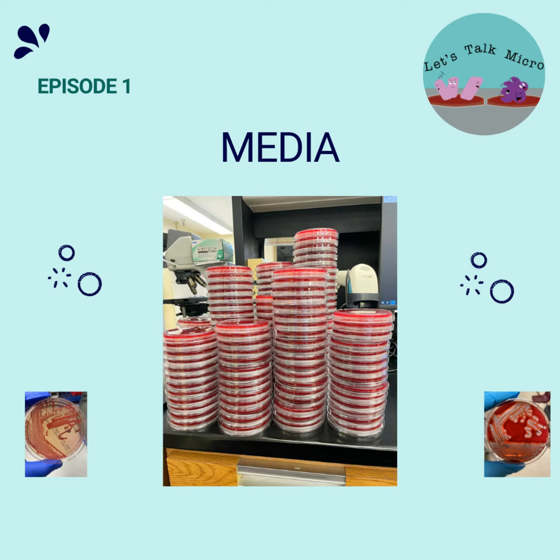And they need moisture. So, they need water for certain metabolic pathways. And even though the media actually has a lot of water in it, when we put it in the CO2 incubators, they start drying. So in order to keep that moisture, you add water to the incubators. So if you're ever wondering why do I have to put water in the incubator? It's just so you can keep this moisture, because the organisms need it.